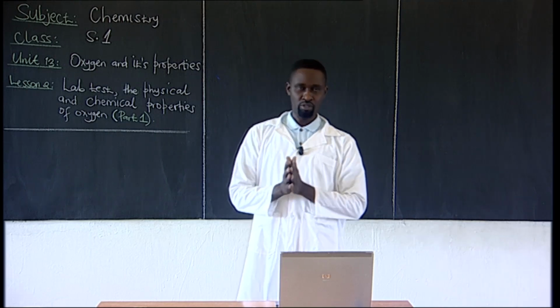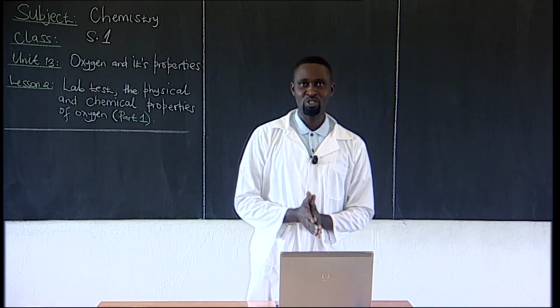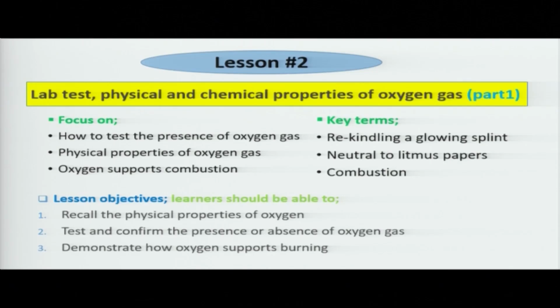Objectives for this lesson are, at least you should be able to recall the physical properties of oxygen, test and confirm the presence of oxygen gas, or if it is not there, you can also use that test to tell that it is not oxygen, then demonstrate how oxygen supports burning.